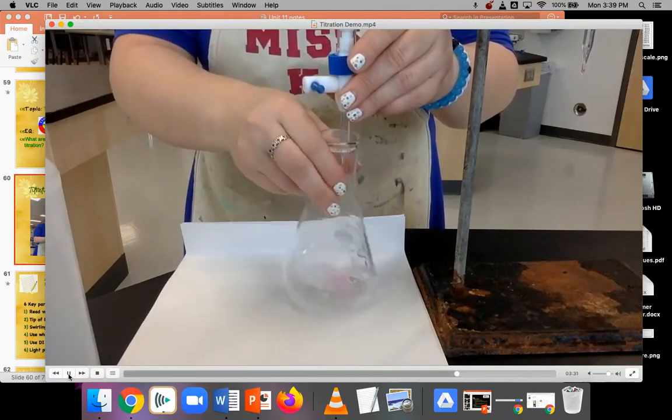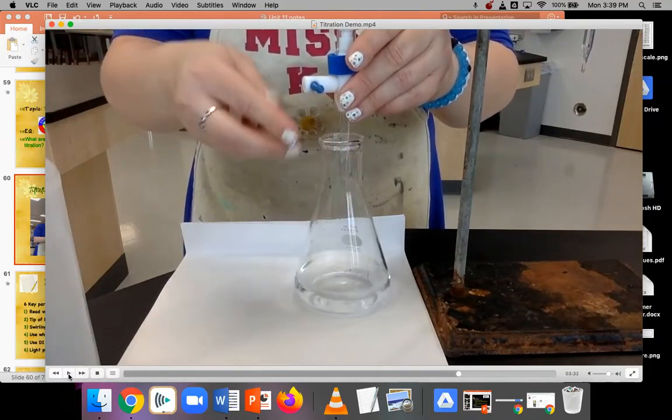Remember, let me pause for a second. The water just adds H's and OH's. It doesn't change my moles of base in my sample, or when I rinse the tip of the acid. So we can add water because it doesn't change the moles of acid or the moles of base. And since that's the ratio I'm looking for, that is allowed. So that's why I'm allowed to add water.